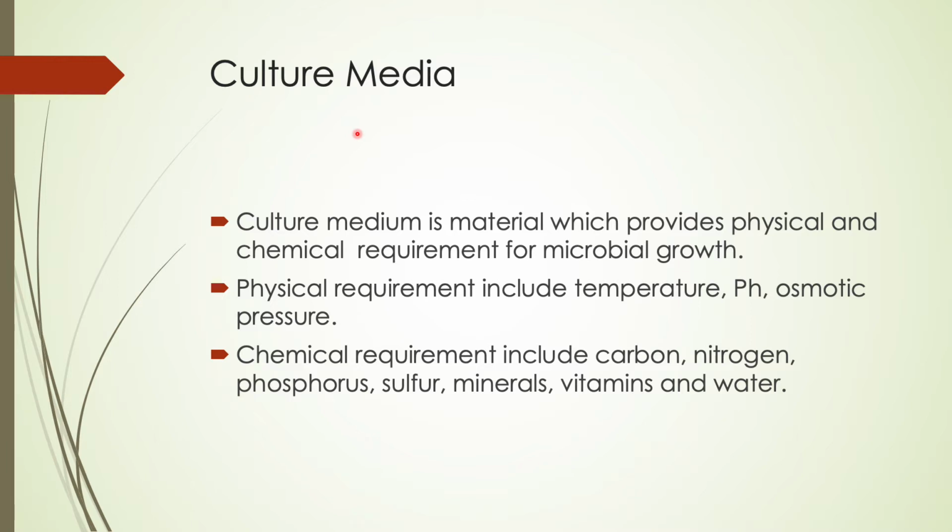And what does it consist of actually? Actually, the culture media is a material. Why do we need the culture media? Culture media is a material which provides physical and chemical requirements for microbial growth.